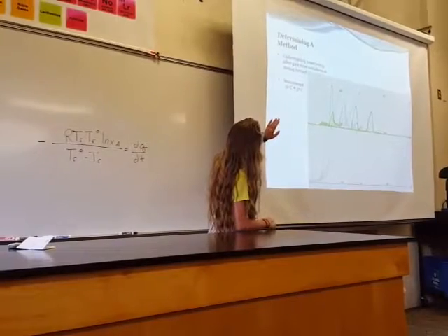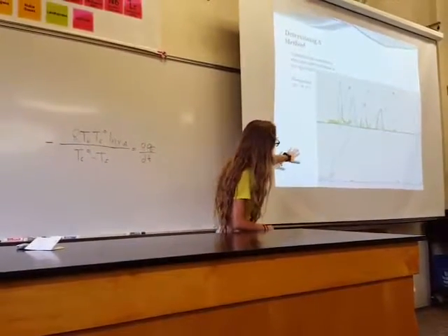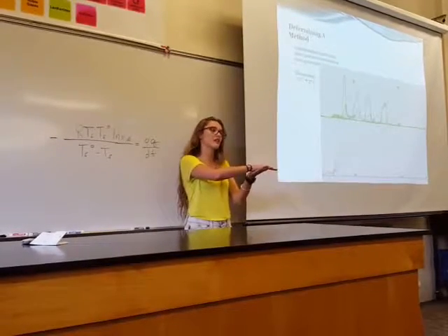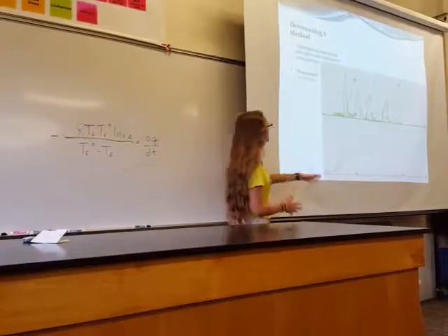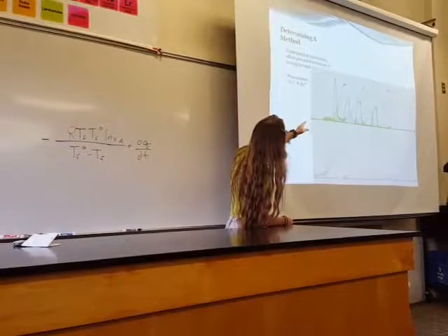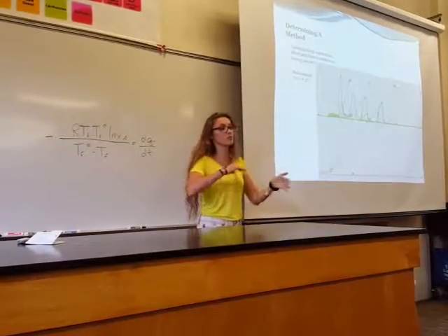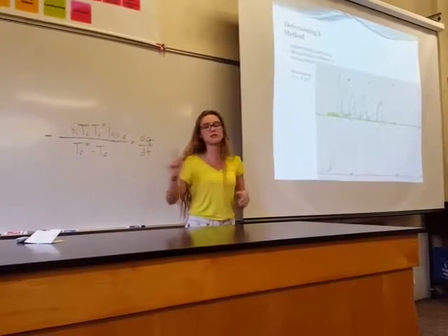Okay, so another important part about understanding supercooling was with the melting curves after the supercooling. And so we did a series of runs for this, and after we were able to just get a general baseline, we felt more comfortable moving forward.